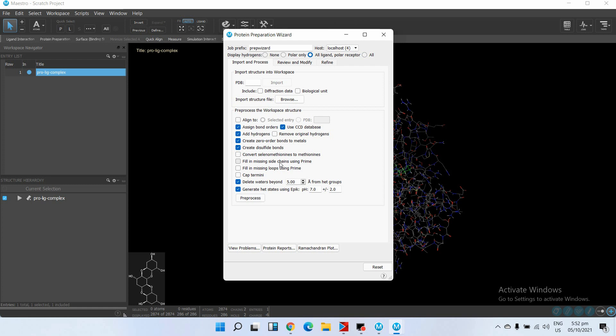So if your protein has missing residues, instead of filling it using Maestro, just go to Modeler. To avoid this long time calculation, you can fill in the missing residues using Modeler. I have already prepared a series of tutorials on how to fill in the missing residues and model proteins using Modeler - that is comparatively less time consuming.